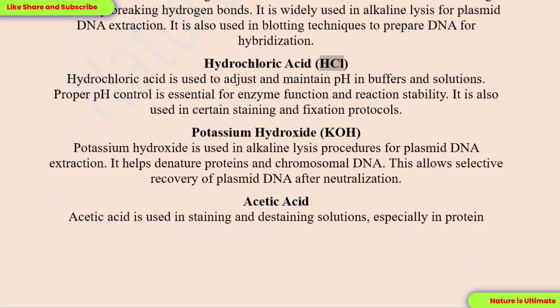Hydrochloric acid, HCl. Hydrochloric acid is used to adjust and maintain pH in buffers and solutions. Proper pH control is essential for enzyme function and reaction stability. It is also used in certain staining and fixation protocols.